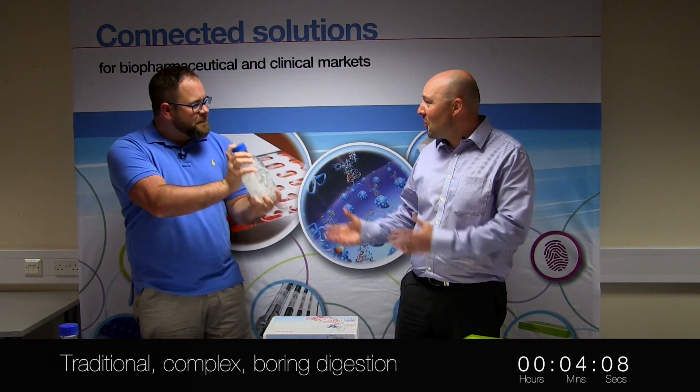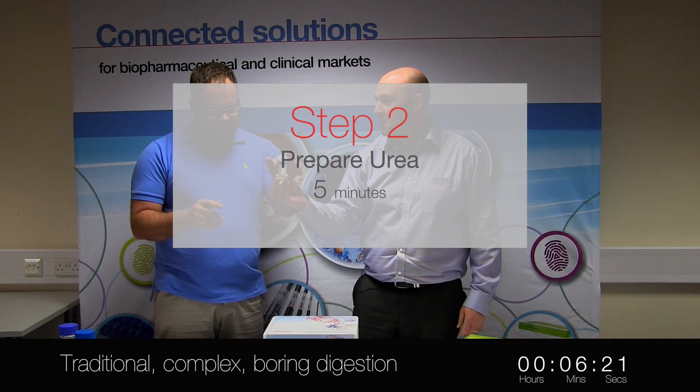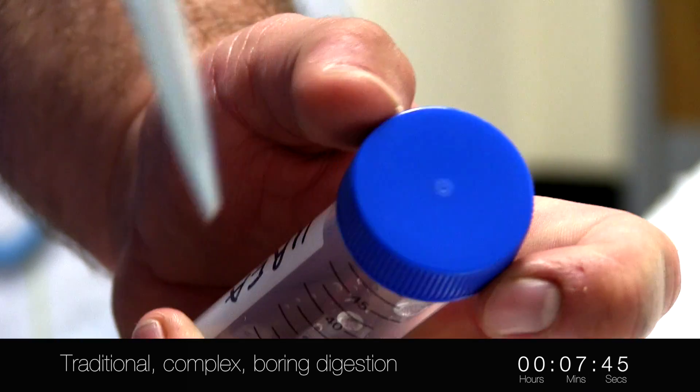It's almost like Tom Cruise. We have our Urea here — 2 grams of Urea. We made the Urea. Give it a good shake again.